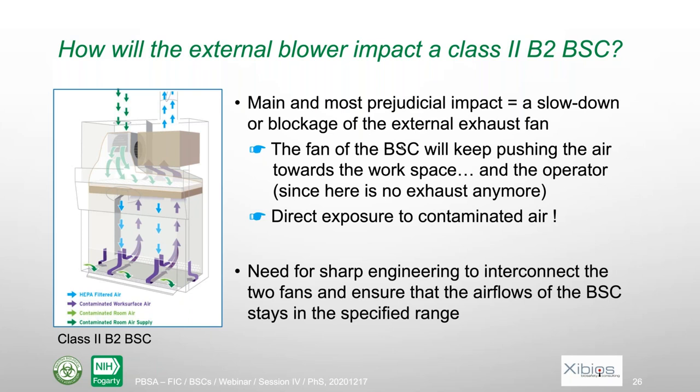The next question is very important, I think: how will the external blower impact a class 2 biosafety cabinet? Actually, the main and most hazardous impact of the external blower is if that blower slows down. If there is something in the piping, for instance in the ducting, or if it blocks at some point, and the fan continues to operate at the same speed, there will not be enough air sucked. That means that the air which is pushed will not be sucked either, and that means that part of the air will go out of the cabinet.